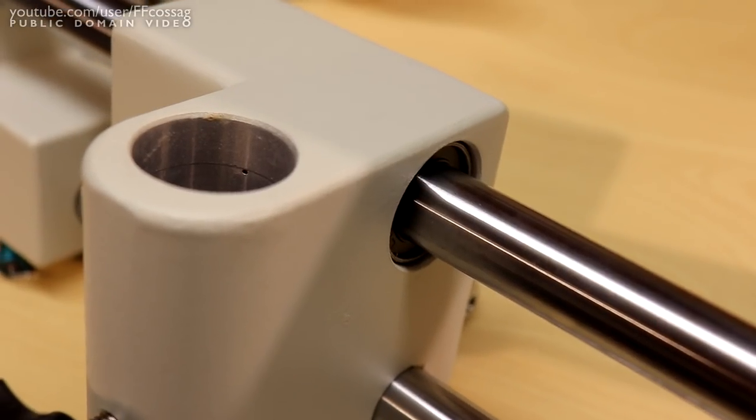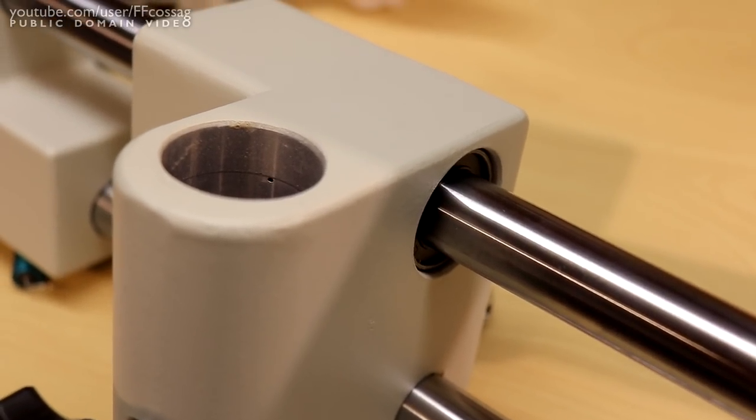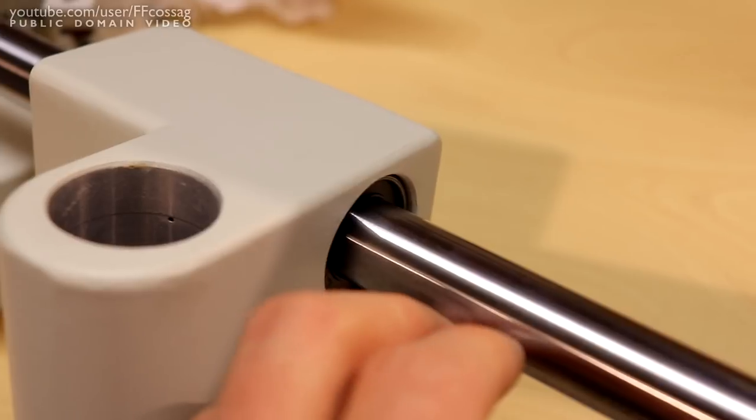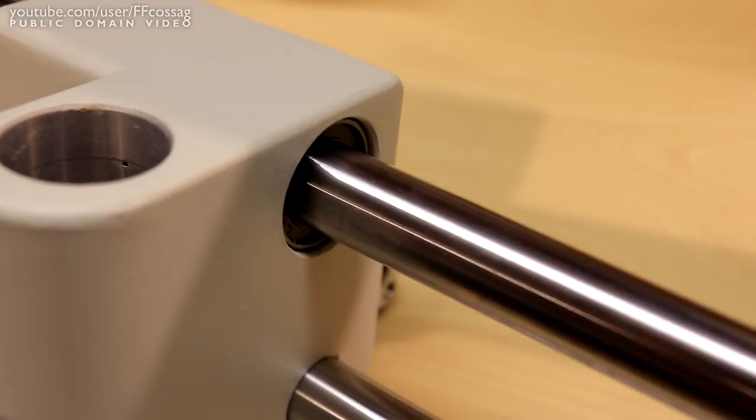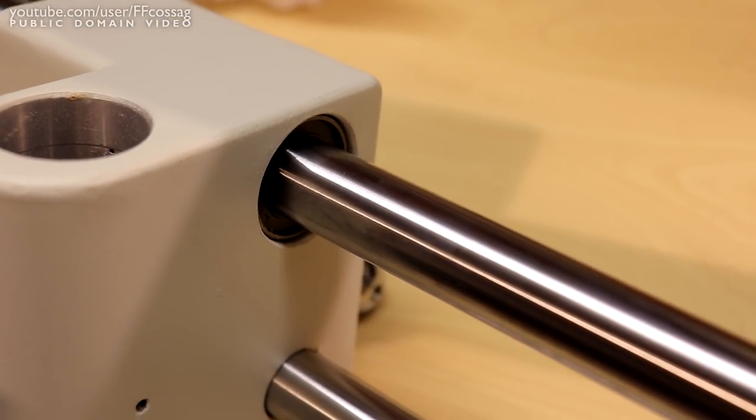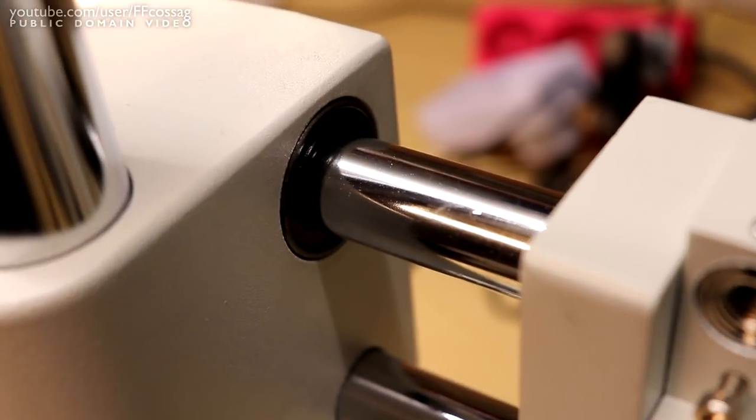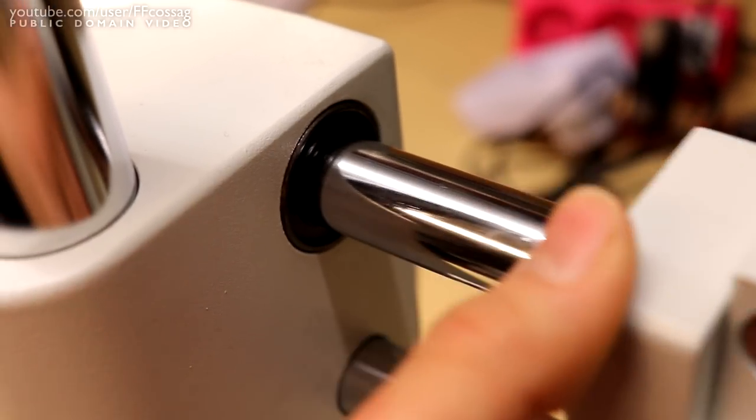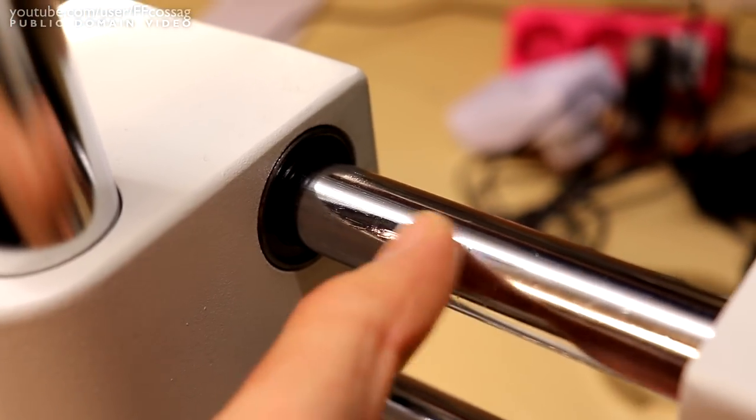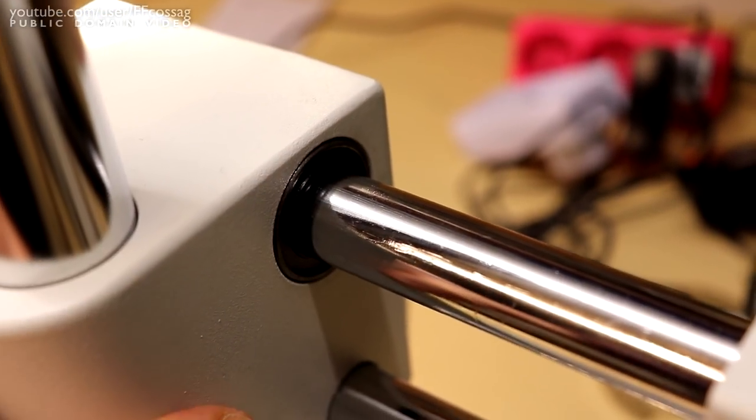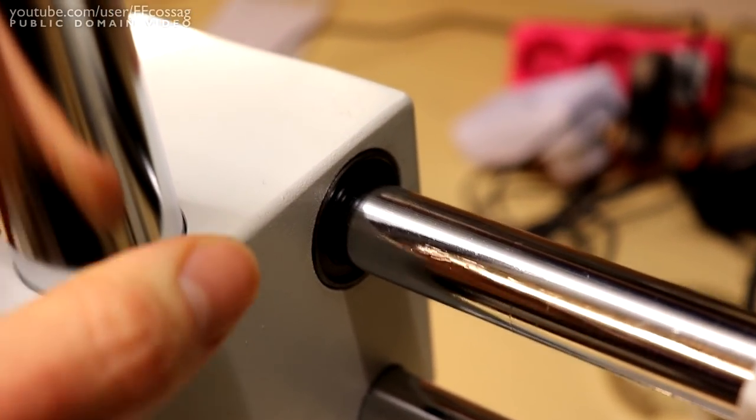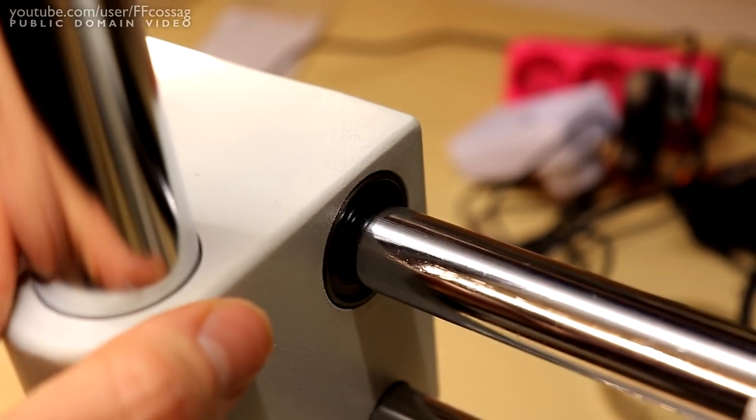This seems to be a completely different material. You can see the matte finish they have going on there, compared to the very shiny chrome finish on the old one. So we're going to be putting this together, installing the new arm, and seeing if it's actually got better materials.